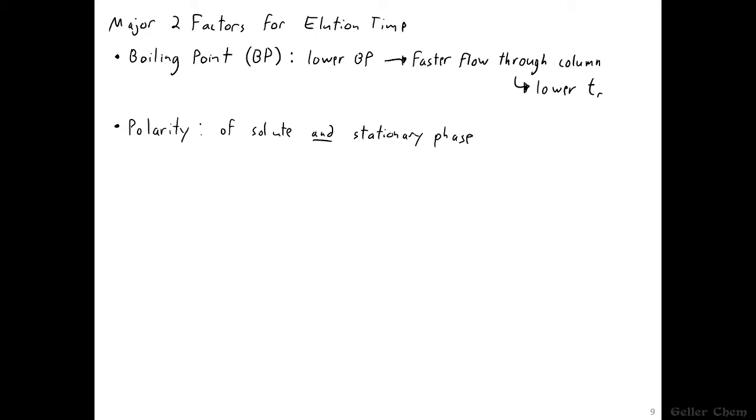You probably remember learning the phrase "like dissolves like." Well, let's use a different phrase. Like interacts with like, which is actually the key to one dissolving the other.